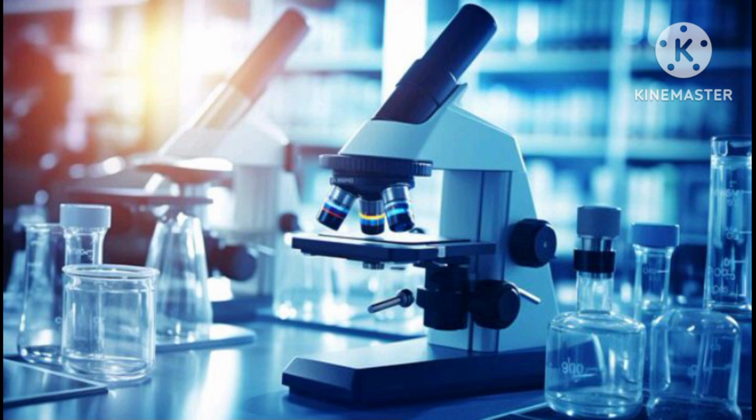Microscopes are made up of lenses for magnification, each with its own magnification power. Depending on the types of lenses, it will magnify the specimen according to its focal strength. They function because they are constructed with specialized components.